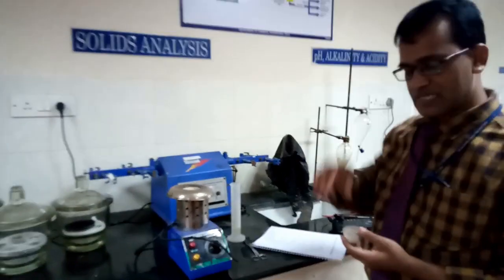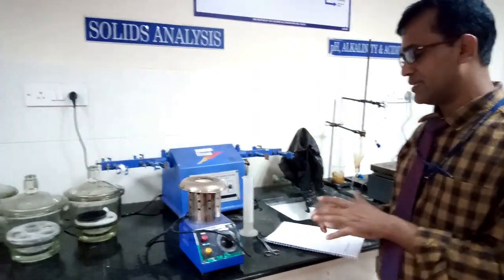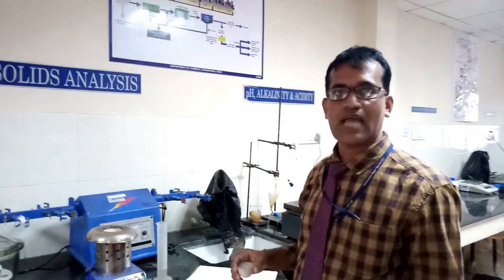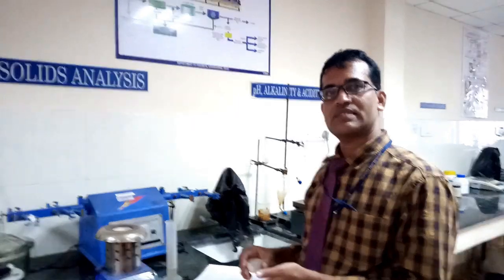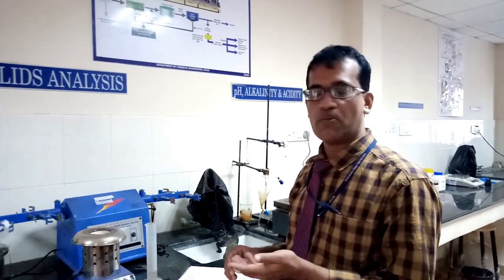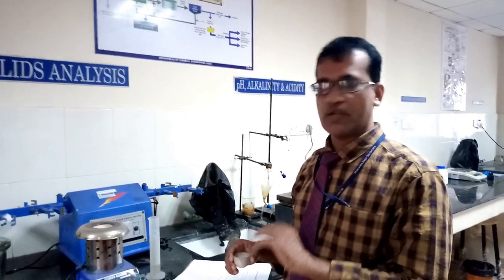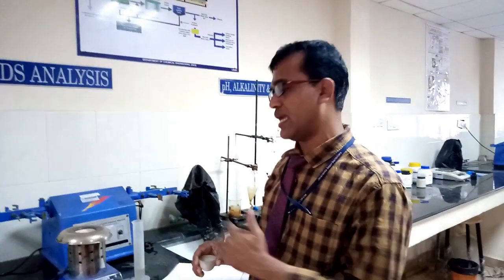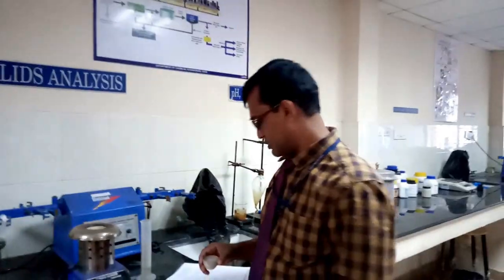The second step is, once you have taken the sample, keep it in the sand bath. Why do we keep it in the sand bath? You have to evaporate all the water so that the volume gets reduced. Once the volume is reduced, you can keep it on the Bunsen burner.